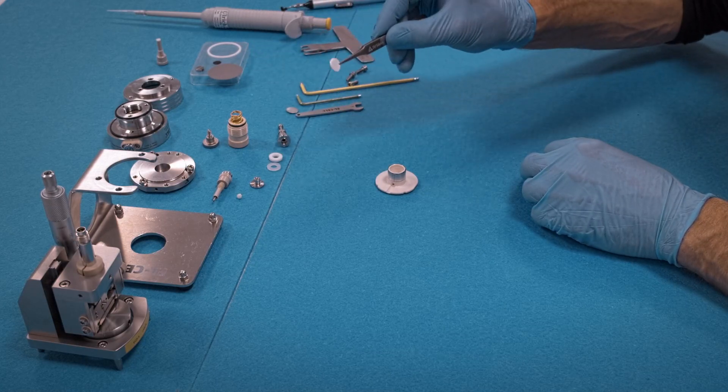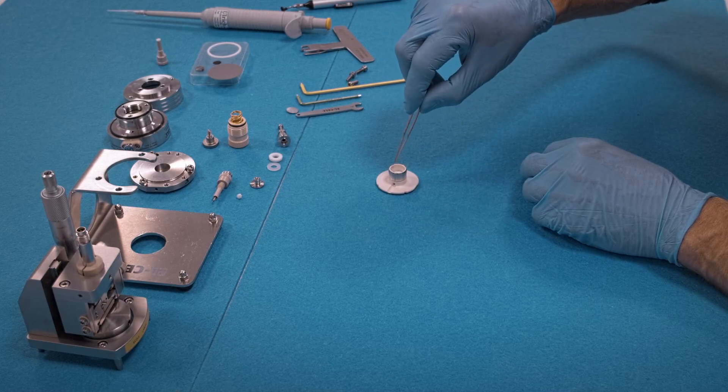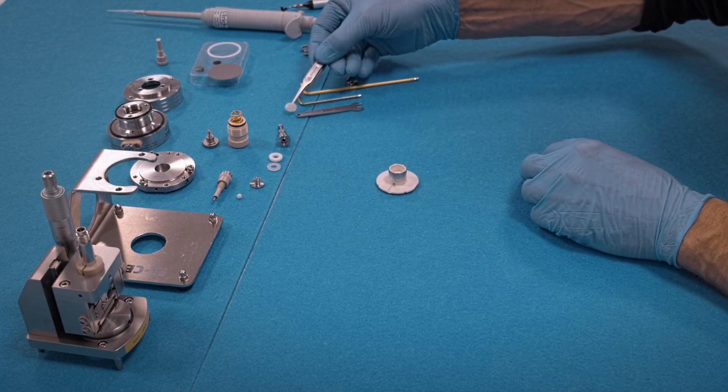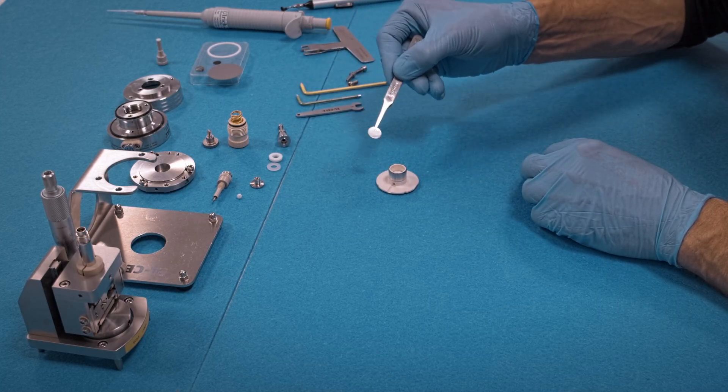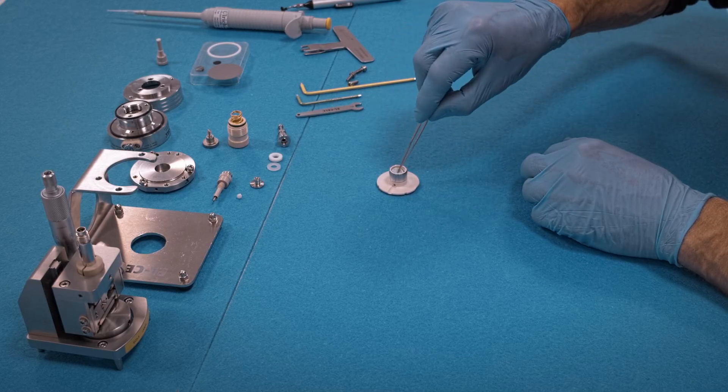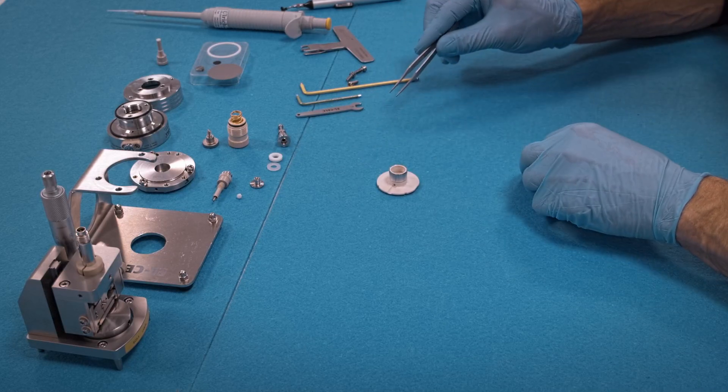Insert the glass fiber separator, 12 mm in diameter, 0.25 mm thick. Then insert the lithium metal counter electrode, again 12 mm diameter, 0.2 mm thick.